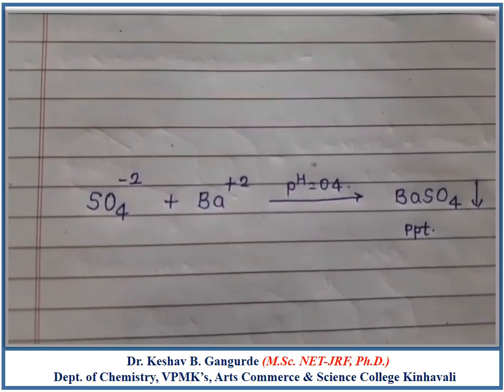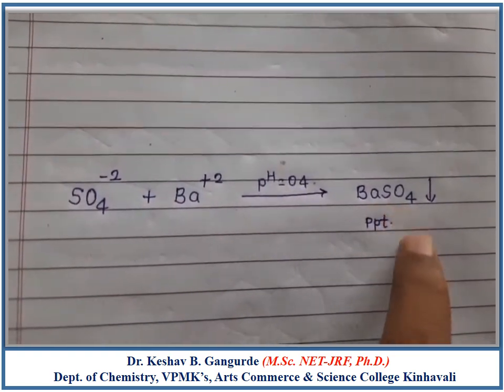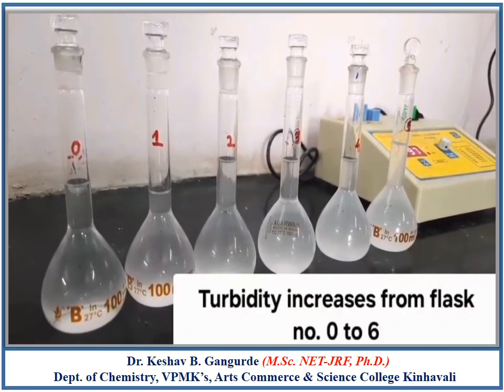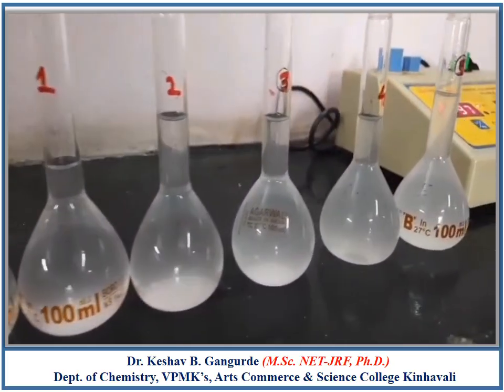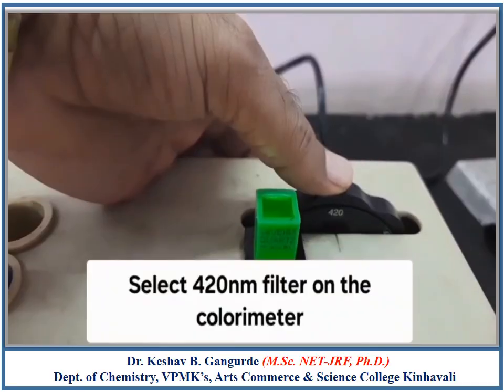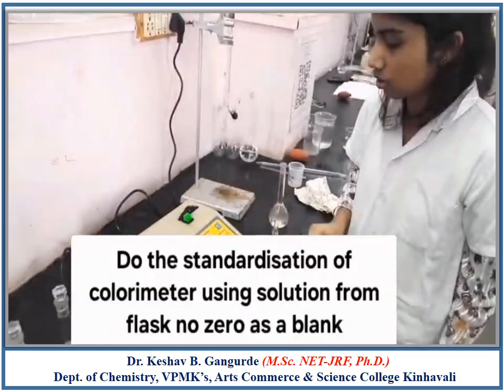At pH 4, there is a reaction between Sulphate ions and the added Barium²⁺ ions, forming an insoluble precipitate of Barium Sulphate. Observing flasks 0 to 6, the turbidity increases from flask 0 to flask 6 as we added Sulphate Iron in increasing order of concentration.